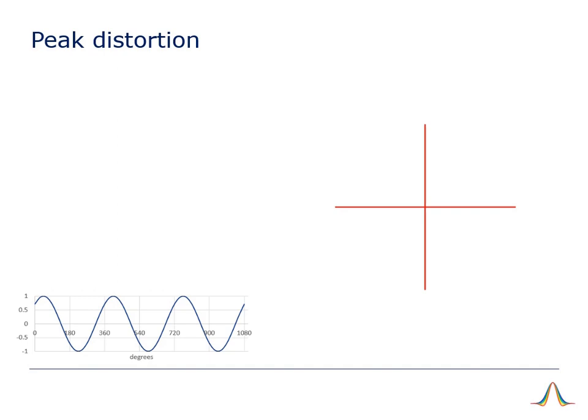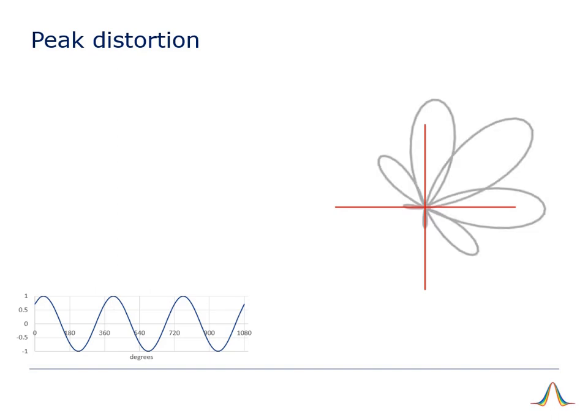To understand what's gone wrong, let's go back to the winding graph idea. Imagine we've recorded a spectrum in an FTICR-MS, and let's just consider one of the peaks in that spectrum for a single ion, and regenerate the winding graph for that ion's frequency. Remember, the centre of mass of the winding graph for that frequency was shown by the red dot, and this gave us the Fourier transform result at that frequency.